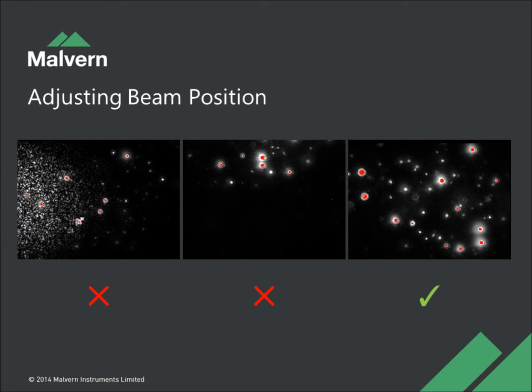The beam should fill the entire screen as shown in the right-hand image. The image on the far left is incorrect, as the thumbprint is filling half of the screen. The central image is incorrect, as the beam is filling the top half of the screen.